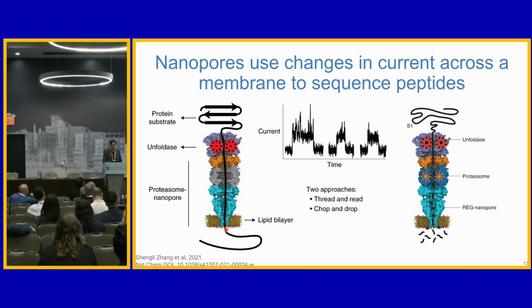We're going to pass the sequence through this lipid bilayer, and in that bilayer, we will measure the current that is changing as a result of that particular amino acid passing through the pore, right? Basically what's going on here is a simple V equals IR equation, where as you pass a new amino acid through, you're changing the resistance of the membrane.